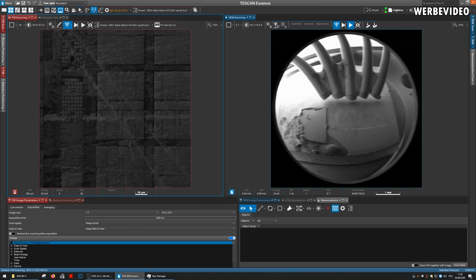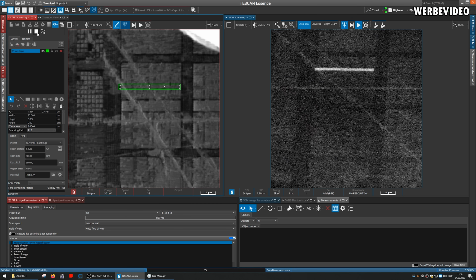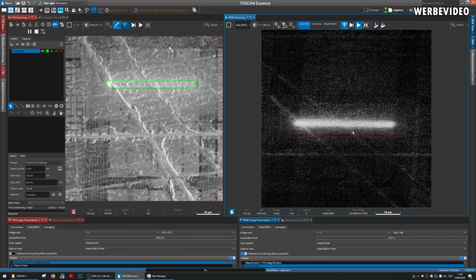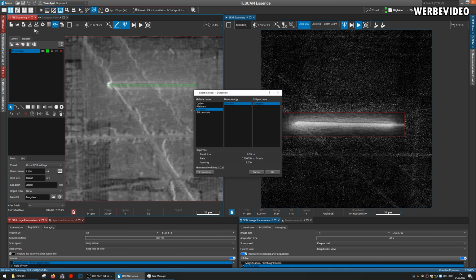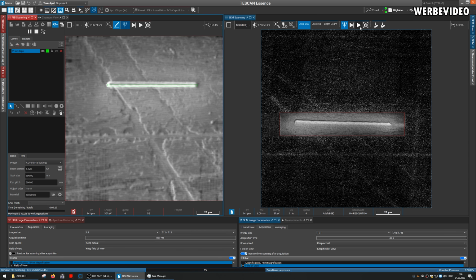We have to perform this step to protect the chip from the top. This will allow easier cutting through the chip later and also give it a tiny bit more stability. The gas is now reaching the surface, and at the point where it's hitting the focused ion beam, we will have the structure building up. On the left side you can see a rectangle which allows easy positioning of the focused ion beam, and therefore how and at which position we are building up the structure.